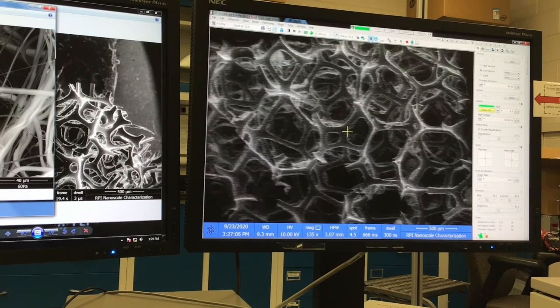So now, here would be an example of our image. We are looking at the same foam that I have just described. Here is an image of that packaging foam. A very small piece is taken away and placed inside the microscope. You can see that this bar is 500 microns. Just in comparison, this is about 5 to 10 times larger scale bar than the diameter of a human hair.